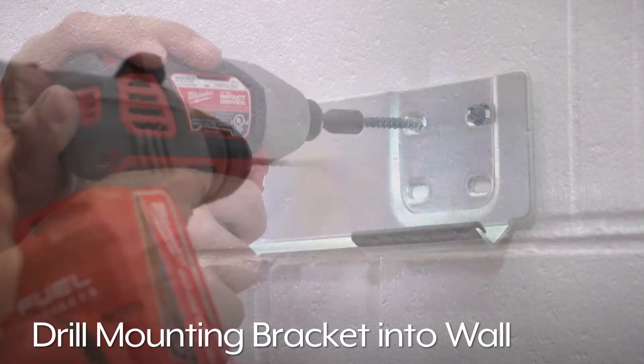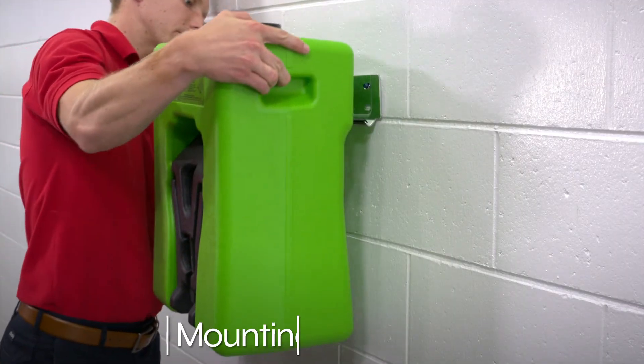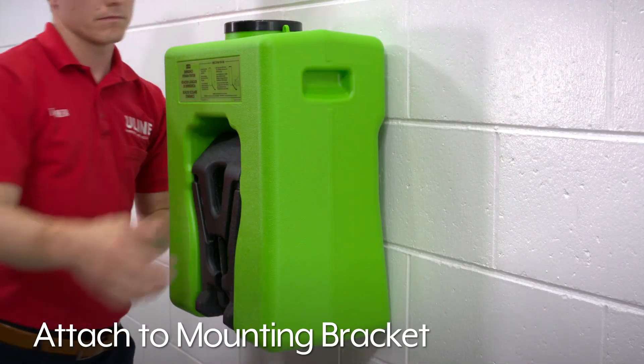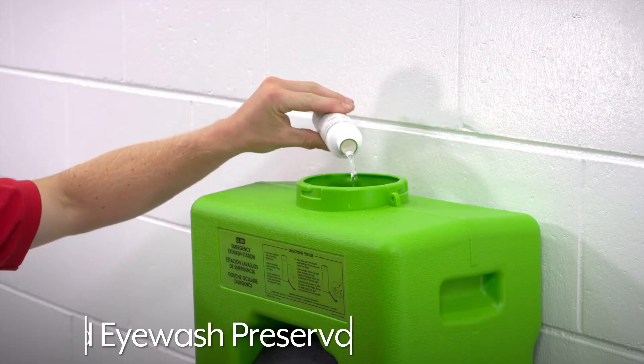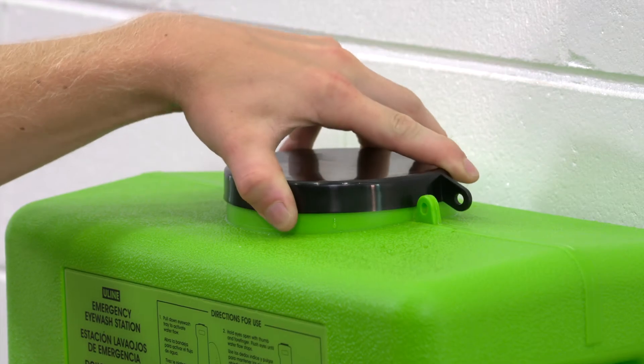Drill the mounting bracket to the wall and attach the station to the mounting bracket. Fill the station to the bottom of the cap opening, add the included eyewash preservative, and screw on the cap.